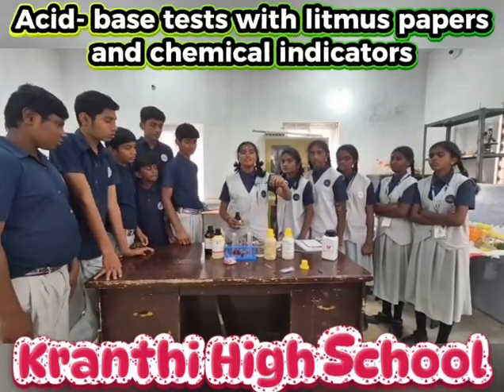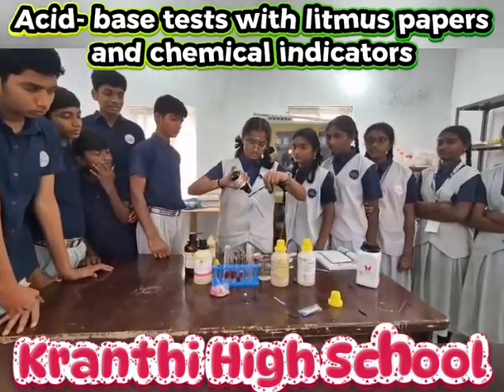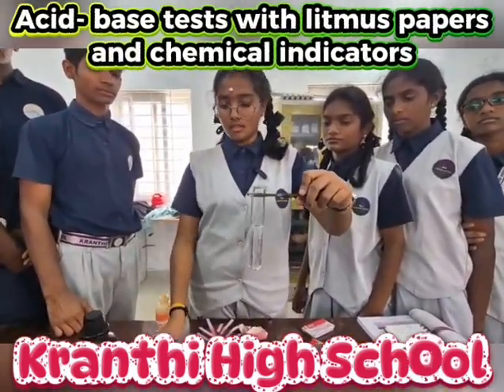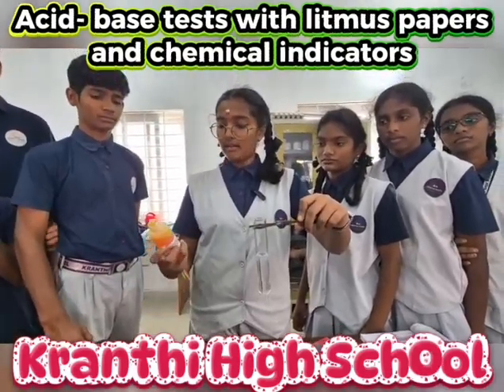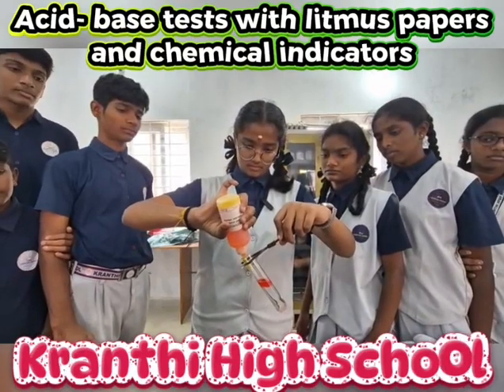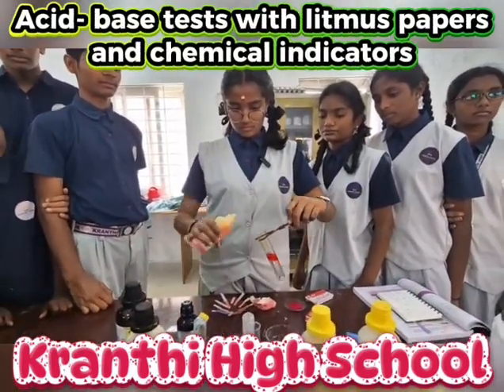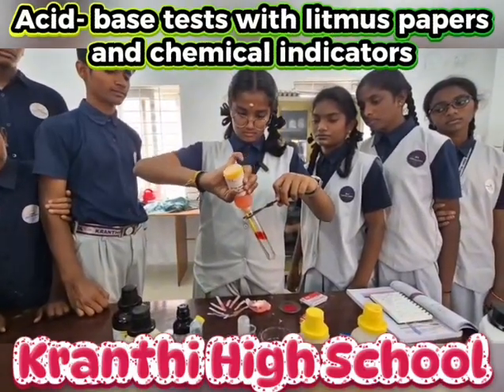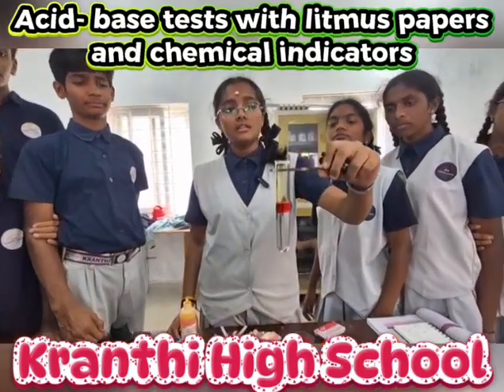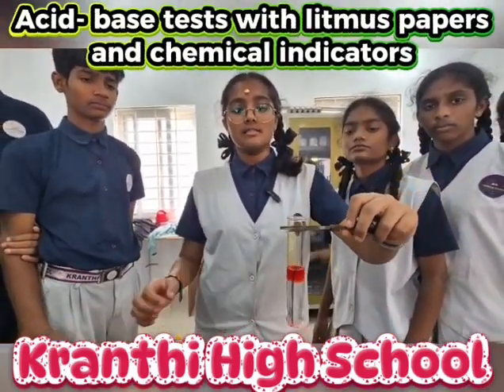Now we are testing sulfuric acid. Now I am adding phenolphthalein to it. As you see, it did not change its color. Now I am adding methyl orange to it. As you see, the solution has turned its color into red. We can consider it as acid.